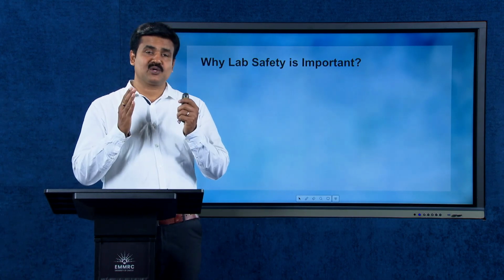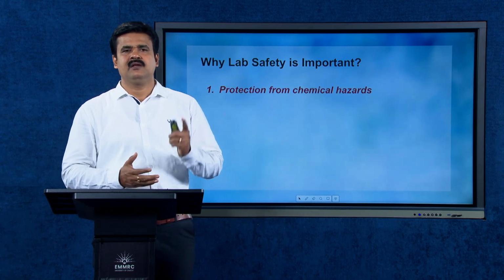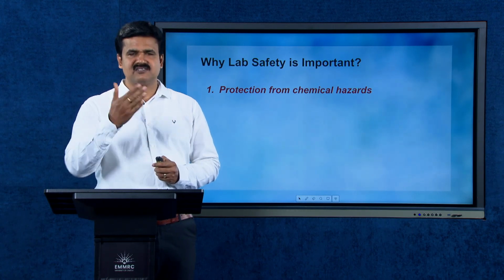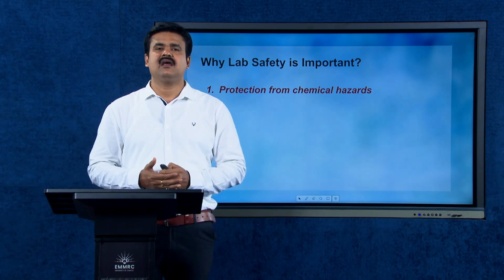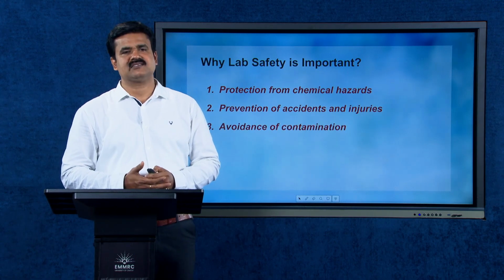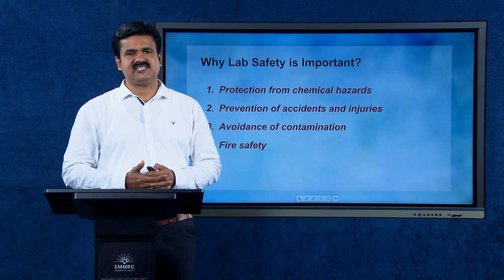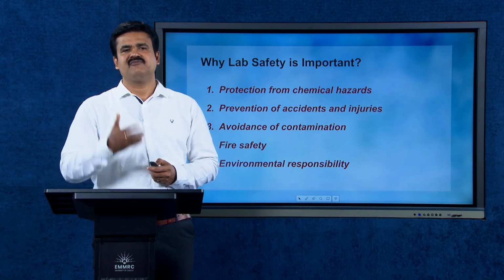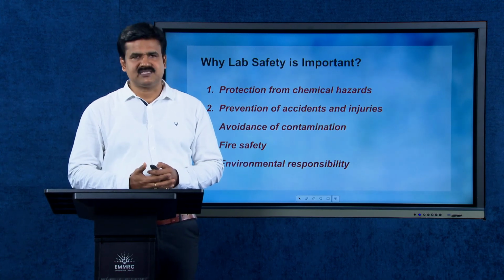This is a very crucial question as far as this module is concerned. Lab safety is very significant because of the following: protection from chemical hazards, prevention of accidents and injuries, avoidance of contamination, fire safety, environmental responsibility. These are very important parameters that necessitate lab safety.